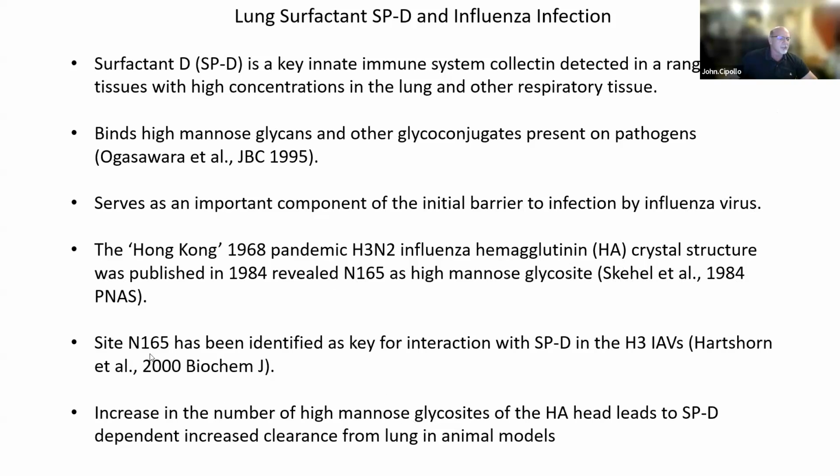So the 165 site has been identified as a key SPD interactor or ligand, and increases in the number of high mannose glycans at that head region really increases the interaction with SPD.